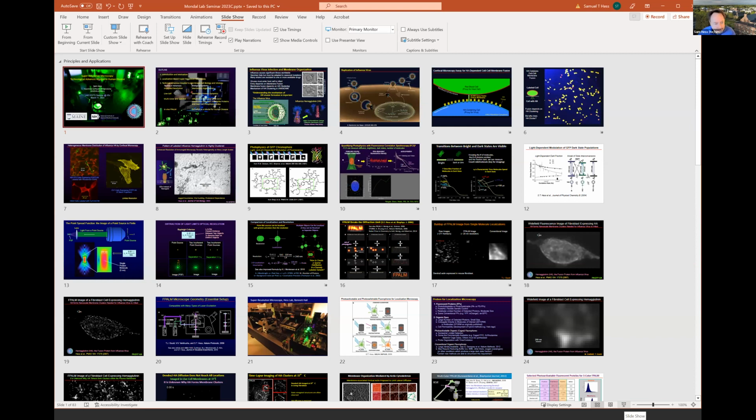These are some pictures of the structure of the virus as it proceeds from its pre-fusion to fusion active or post-fusion state. You can see these trimers of hemagglutinin on the surface of the virus. So where is this in the life cycle? As the virus binds and is enveloped by the host cell endosomal membrane, the hemagglutinins undergo a conformational change that opens a fusion pore that allows the RNA to get in.